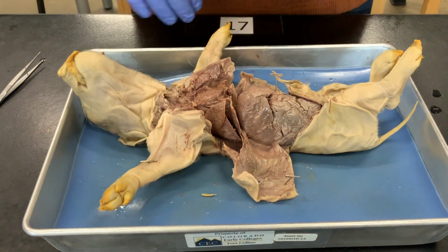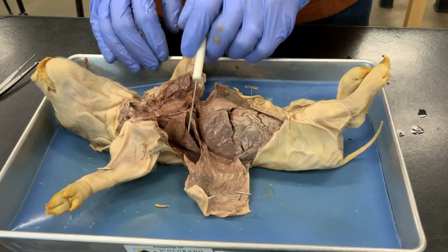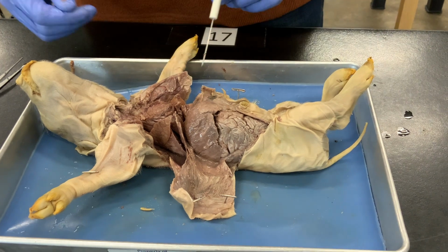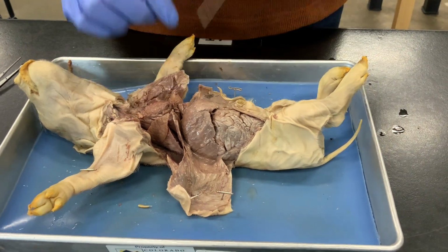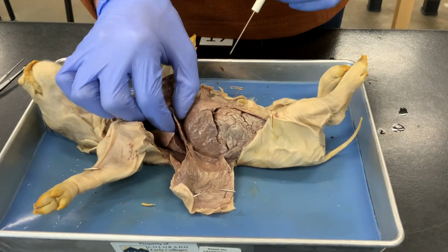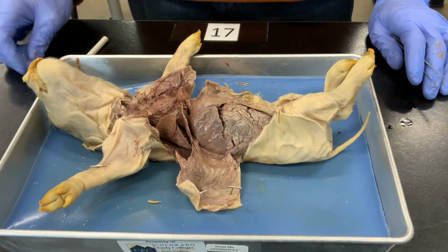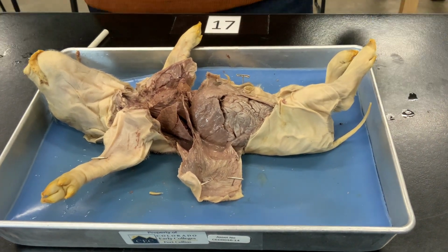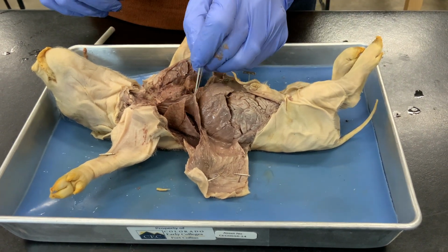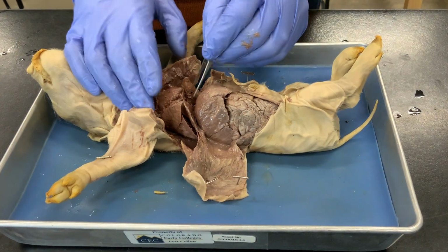All right, so we'll start again with the diaphragm in the center, which divides the abdominal cavity from the thoracic cavity, the 2 sections of the body cavity. The diaphragm on a pig, in proportional size, is much thicker. Pigs have a faster metabolism than the frogs, and so they need to breathe more because they use more oxygen. And so the muscle that you breathe with, the diaphragm, is a bit thicker on this animal.